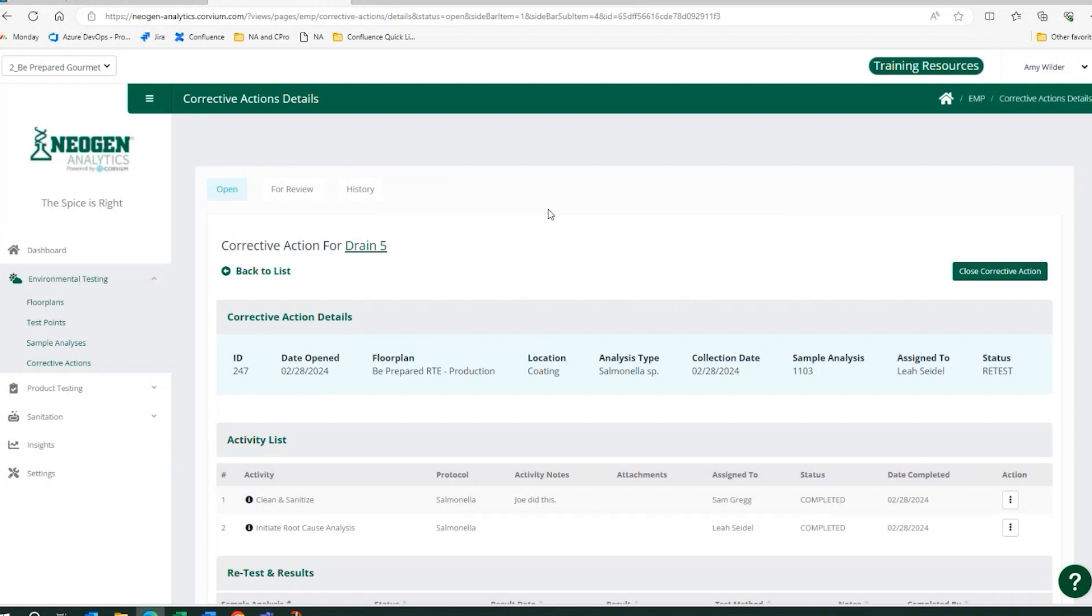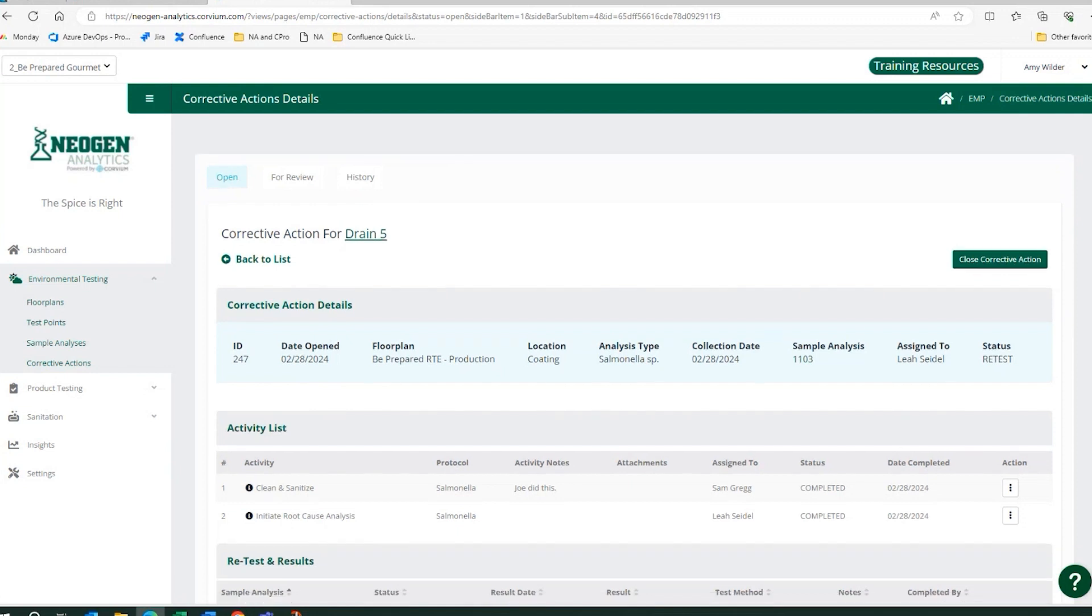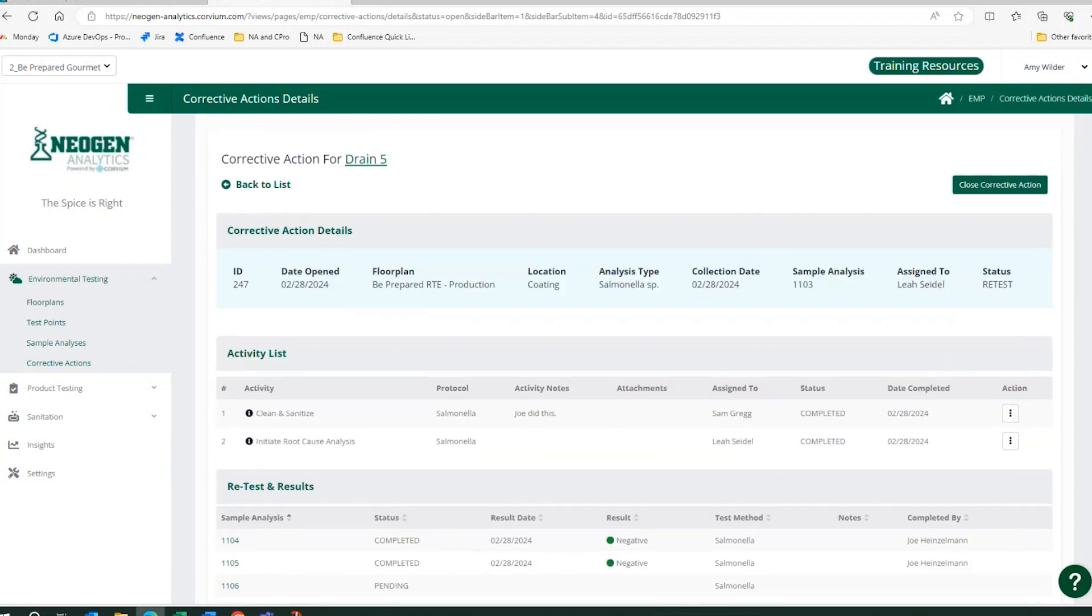I know that I have a failure on my drain number five here. I've been asked to go out and work through this corrective action. I'm new. I don't know the policy, right? That's okay. I don't need to. Settings is going to drive that for me. And within the application, I would open up this corrective action and see the type of failure it was.